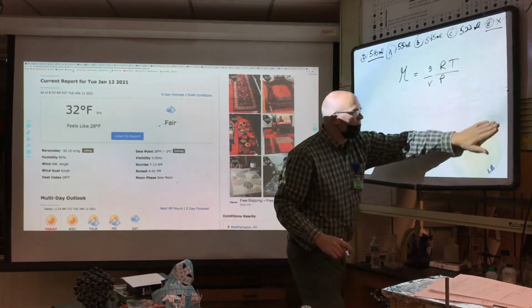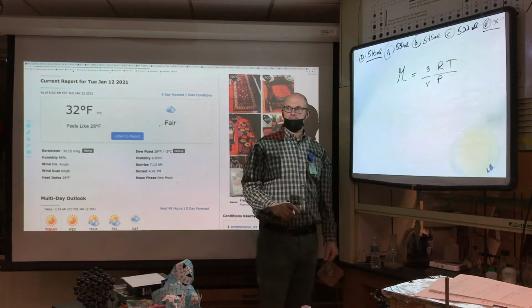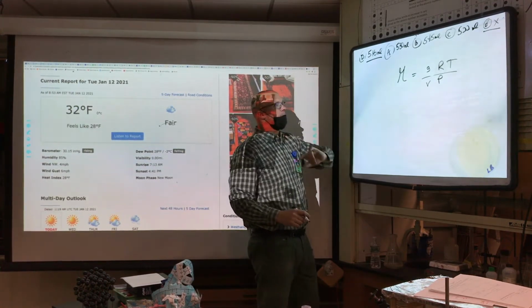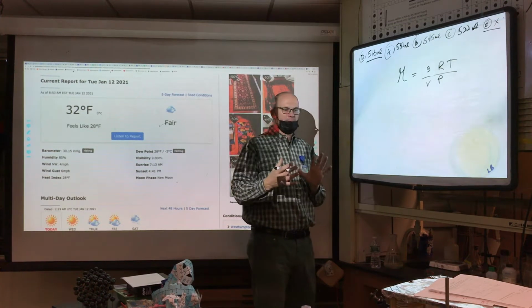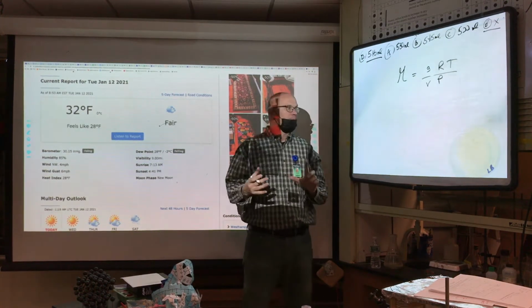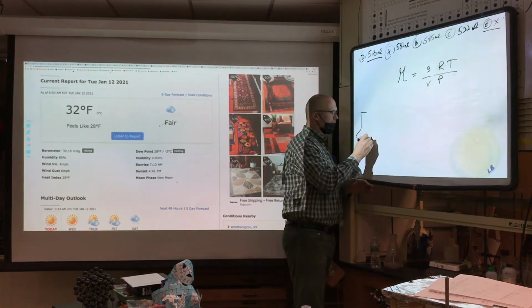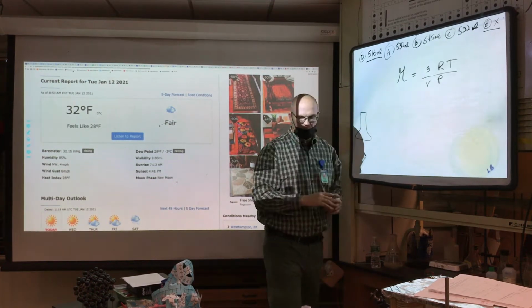So, party people, the first thing is to notice what flask we're using, okay? And the flasks have a certain volume. What we're going to skip in this stream is that someone previously has taken this plastic Erlenmeyer flask and filled it up with water.